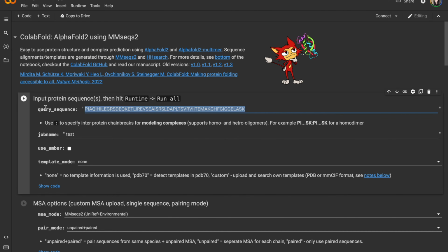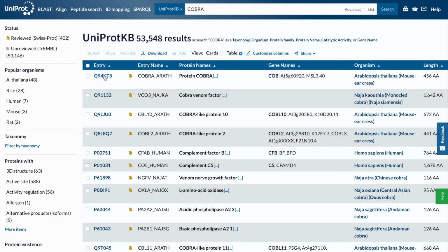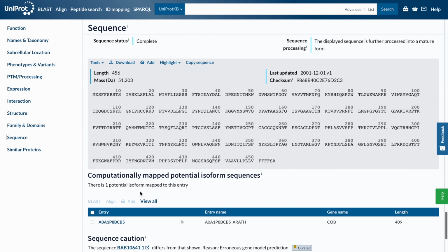This first line is where you would paste your protein sequence that you want a prediction for. So what you'll do is delete the example sequence and then paste whatever sequence you want here. So let's say you want to test a specific mutation on a protein. I'm just using UniProt, so I would find my protein, scroll to the bottom to find its sequence, and then press download.